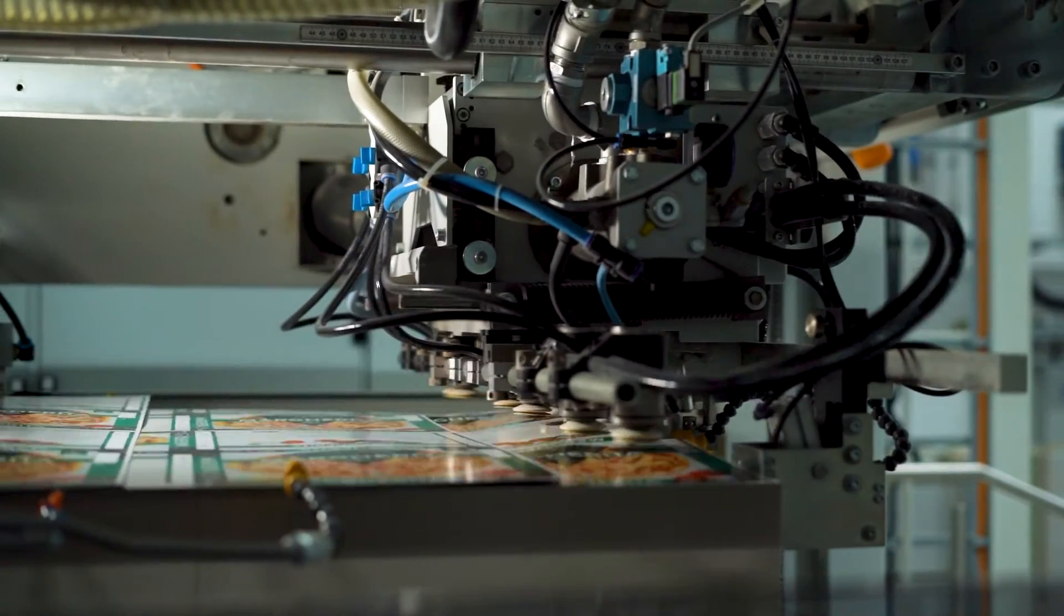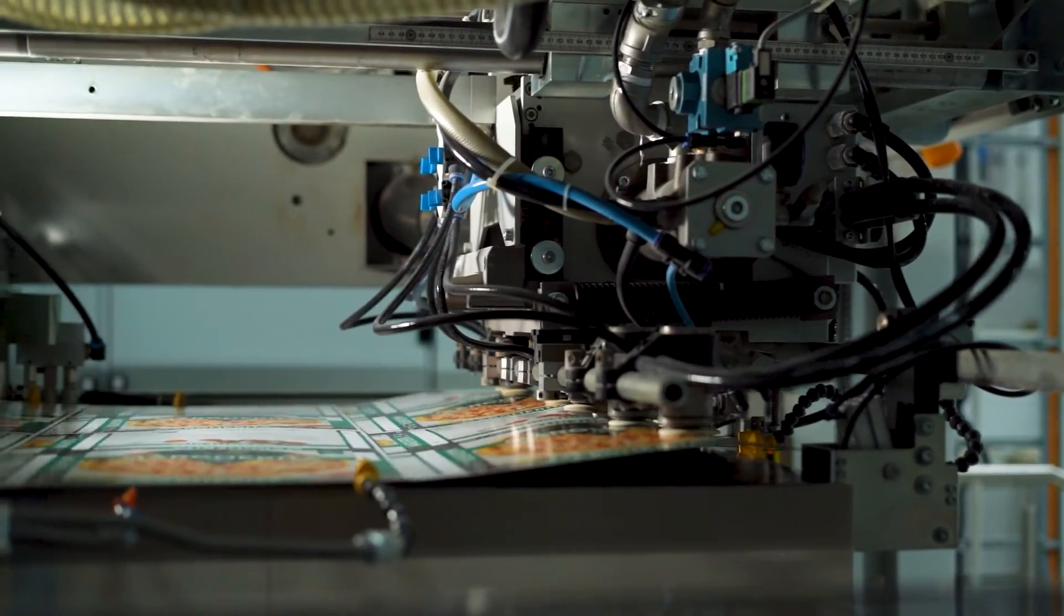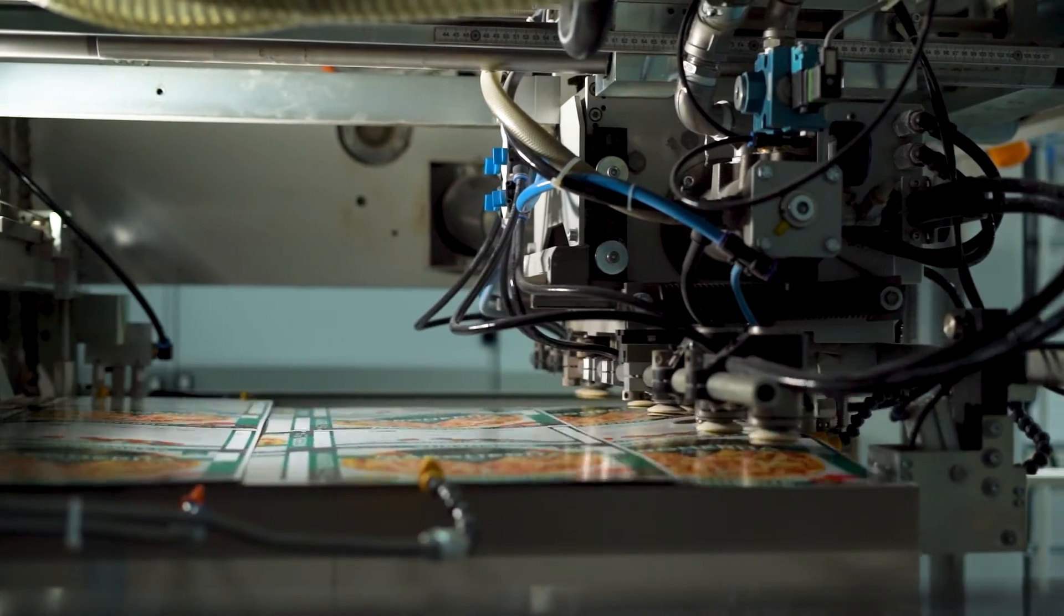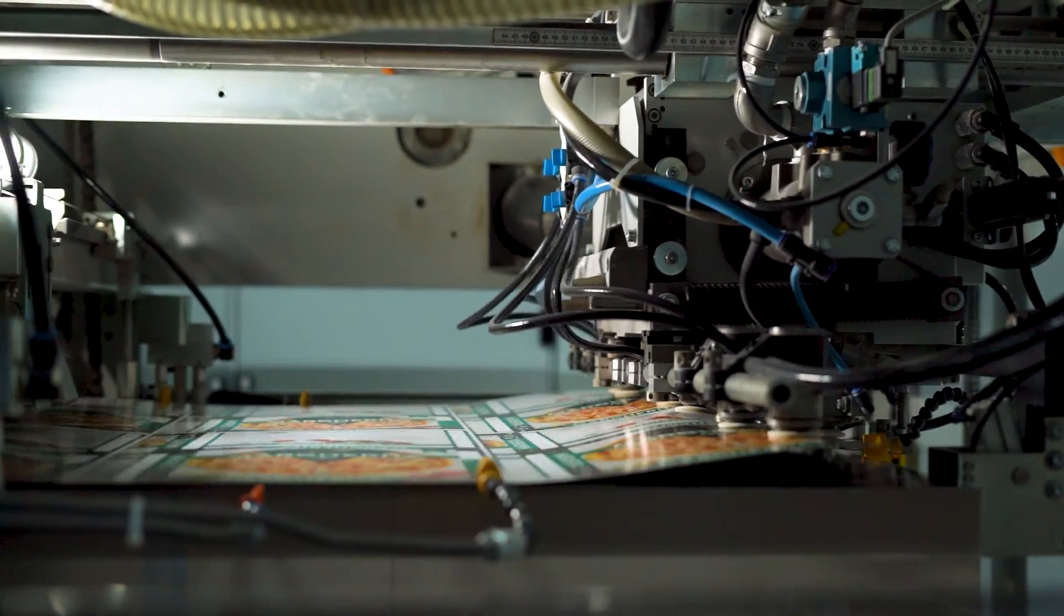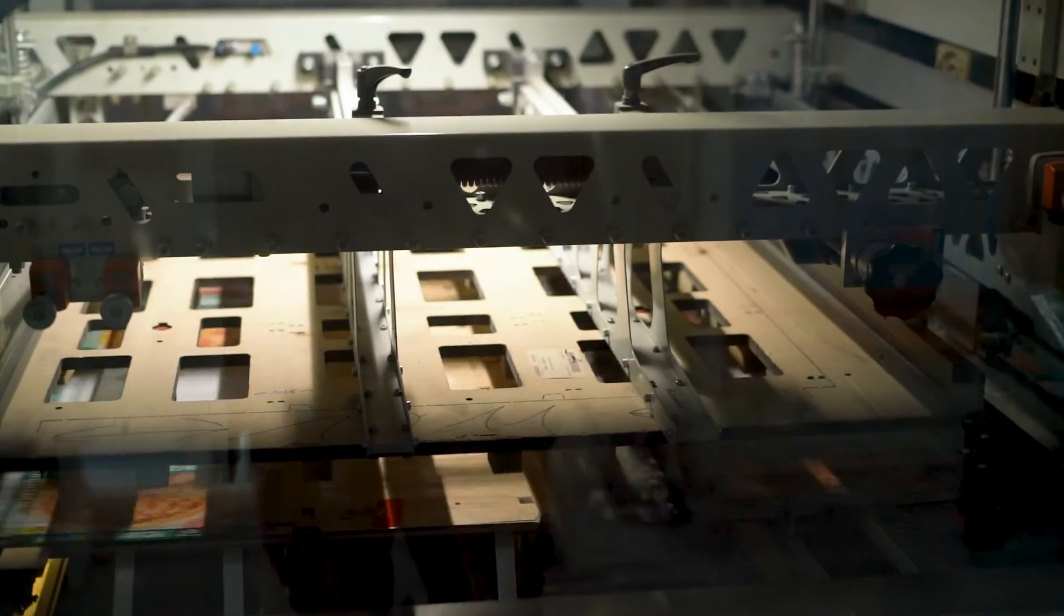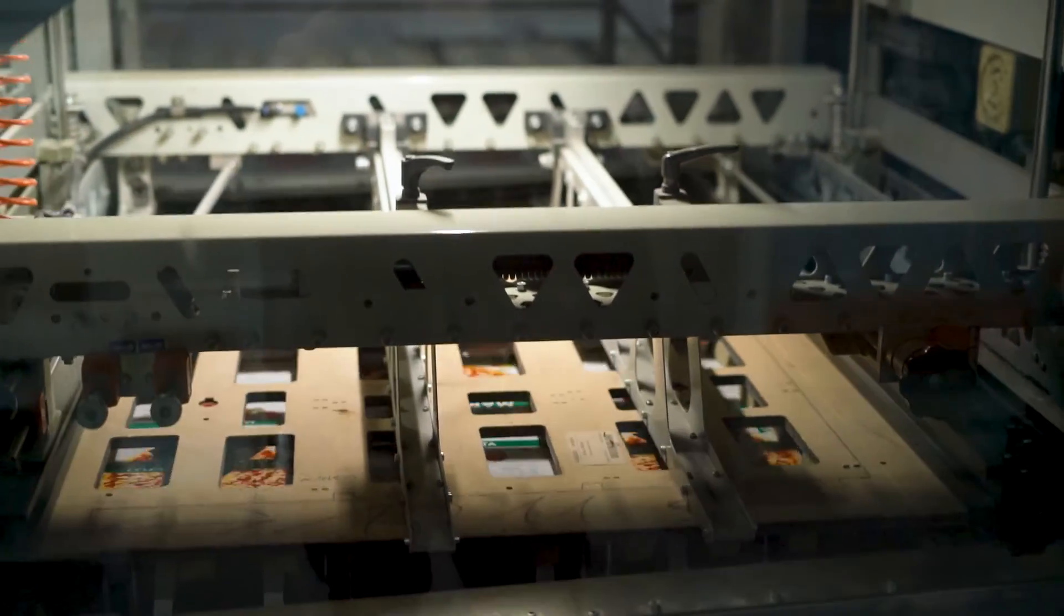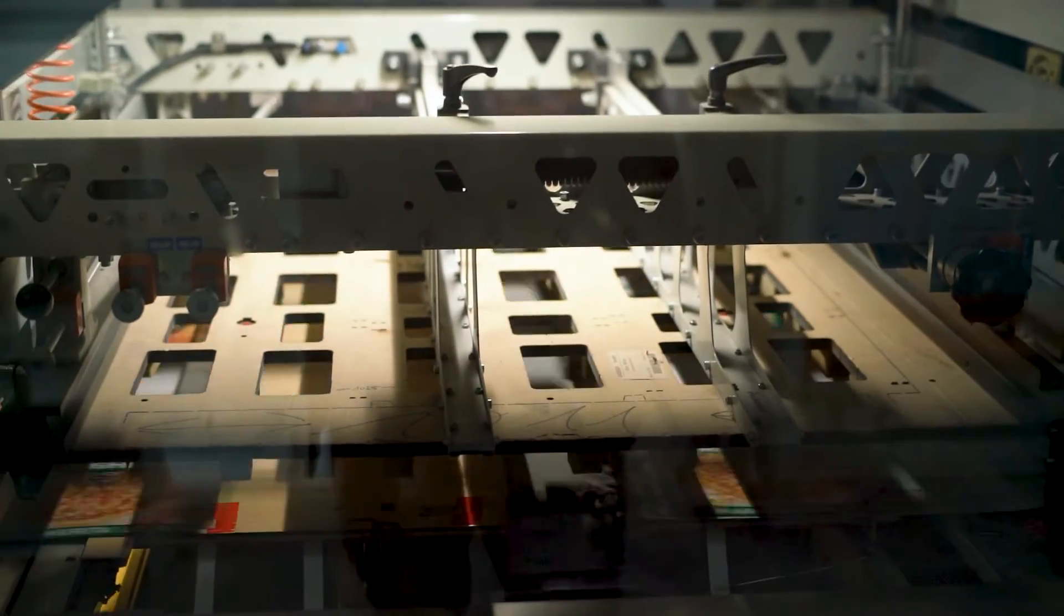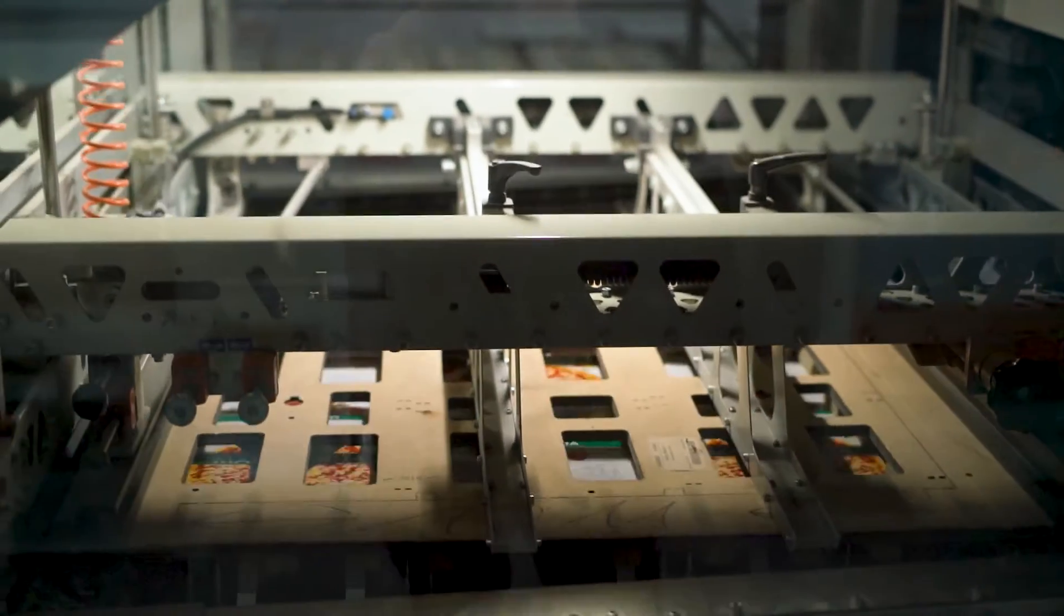And many of those, from lamination to printing to cutting, introduce stress to the material. Thermal stress, for example, could lead to degradation or oxidation of the polymers used in such packaging.